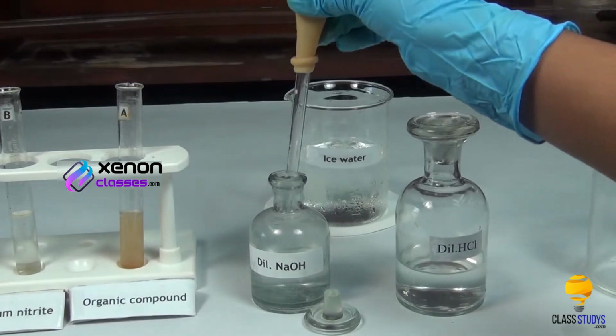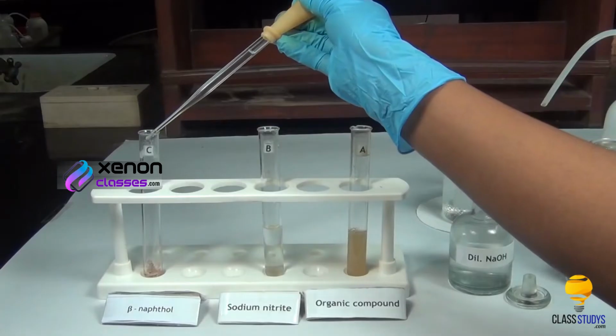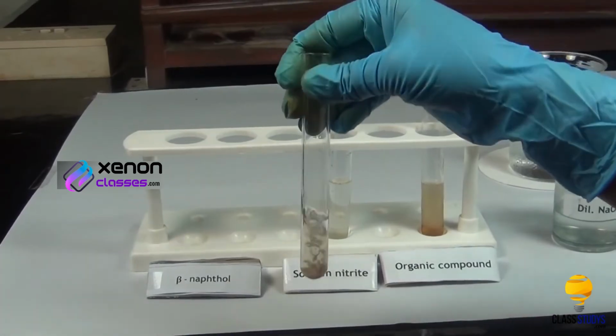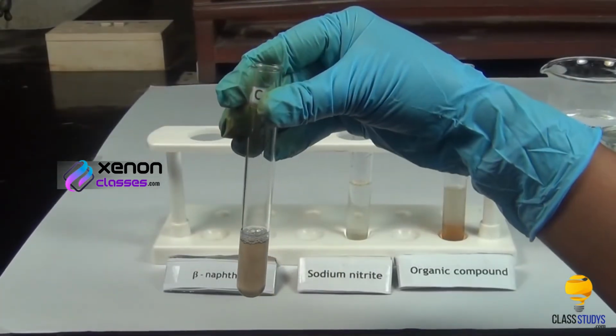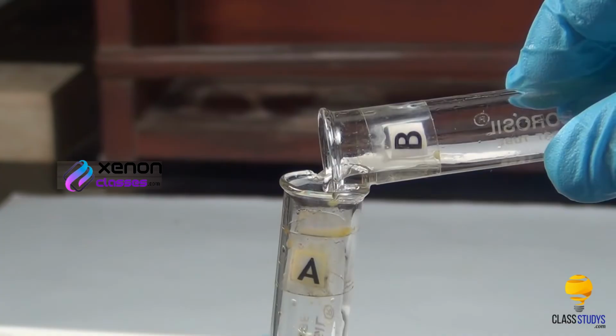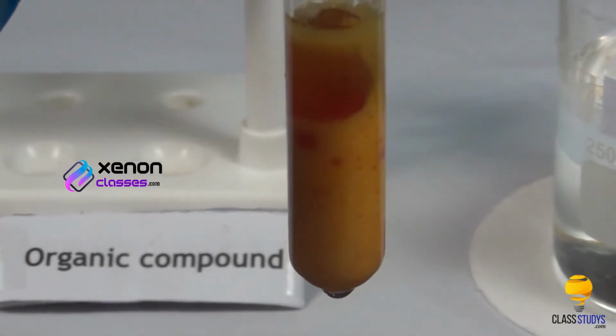Using another dropper, add a small quantity of dilute sodium hydroxide solution to test tube C. Shake the test tube well to dissolve beta-naphthol in dilute sodium hydroxide solution. Cool the test tubes in a beaker containing ice-cold water for some time. Now, add sodium nitrite solution to the organic compound.